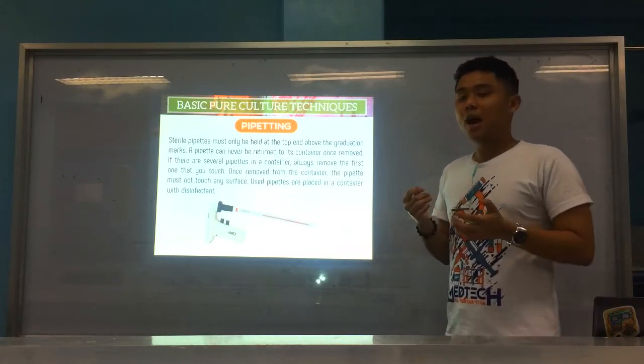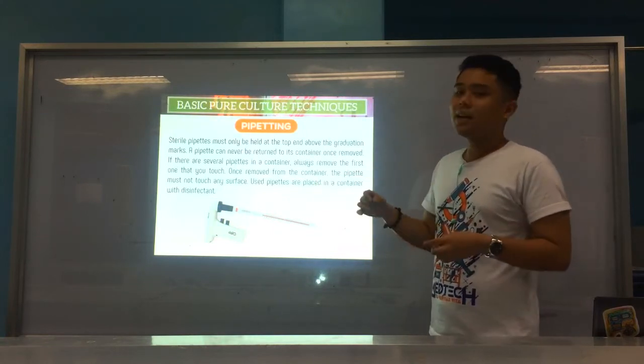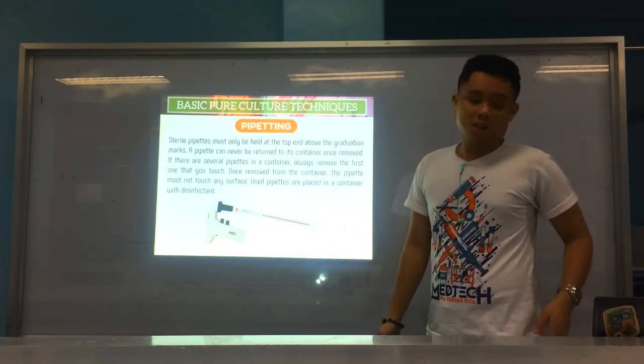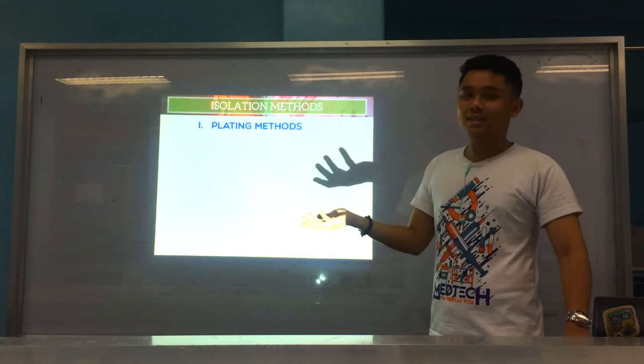Okay? And once you have used it, it should be returned to a container or put in a container with disinfectant, especially if it's a serological pipette. But if the pipette is disposable, then of course we dispose of it in the proper garbage containers. Okay? Alright. Now we go to your isolation methods when it comes to plates like Petri dishes.